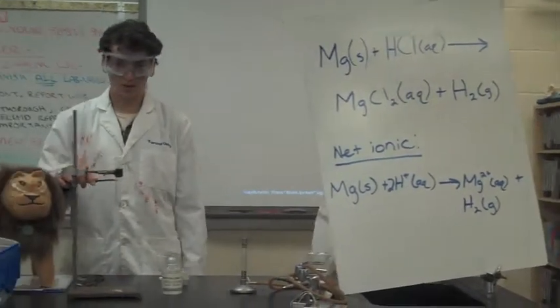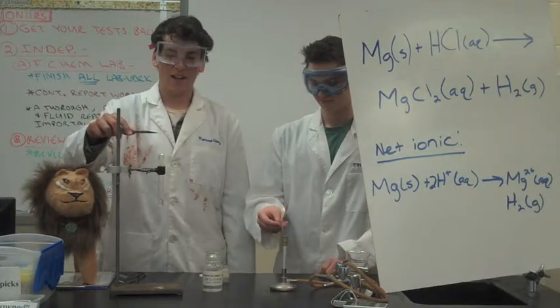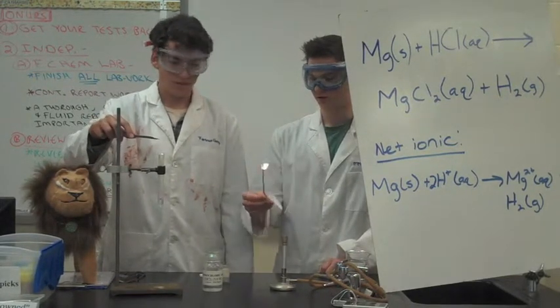Alright, join me, Carlton. Ready to light the stick? Alright, so now I'm going to add the magnesium. Ready? You on fire? Go on fire.